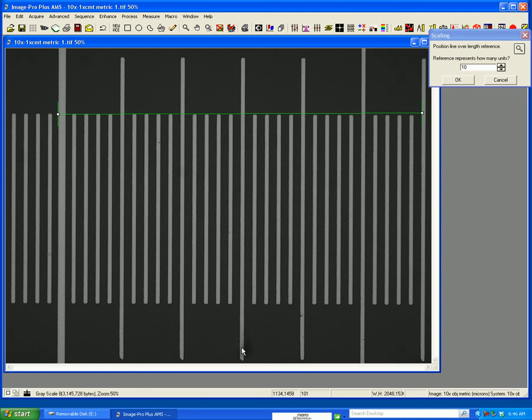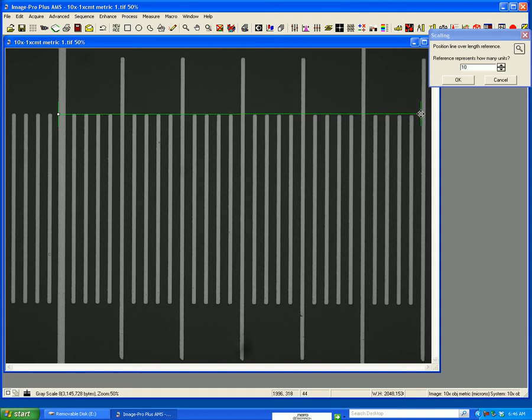If I go to the white, it's going to be towards 225. So my goal is to position this on the edge. Note the value down here was 74 and to try to match this as best I can up on the other side.